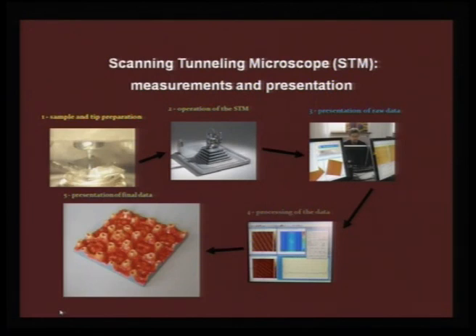In the scanning tunneling microscope, the protocol, as I told you, the first step is sample preparation, then tip preparation. This is a real-time photograph taken in an ultra high vacuum environment, where you can see the tip approaching the surface of the sample, and you can see the tip seeing the mirror image of itself as you bring it closer to the surface.